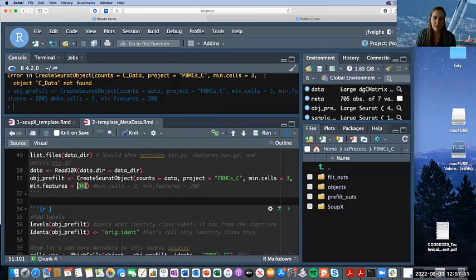But the reason why we have it set as 200 is if there's a cell with less than 200 features, especially with this data set, which is a well-tested classic example data set, then it's likely that it is not a full cell, that it is ambient mRNA still in the background. So that's us setting that minimum threshold, knowing that we're getting these reads in the sequencing data from droplet-based single-cell RNA sequencing. Since you know how things happened from the bench side, the bench side will and should influence the bioinformatics side and what you're doing statistically as well. So it depends.